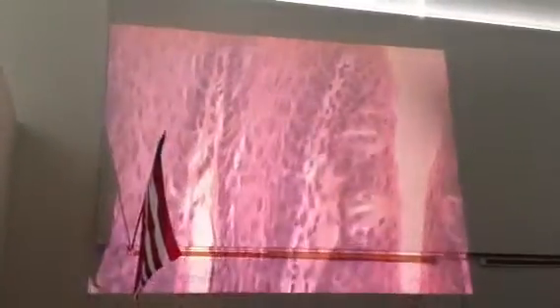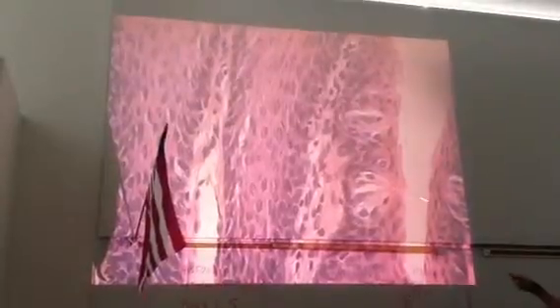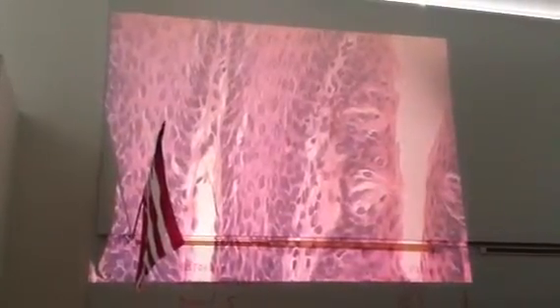Not that we're going to have 3 tongue slides on the practical, but you can see where you have taste cells and supporting cells, and you can see the openings right there. So it's going to stick a taste hair out there and detect whatever the taste happens to be in the environment.